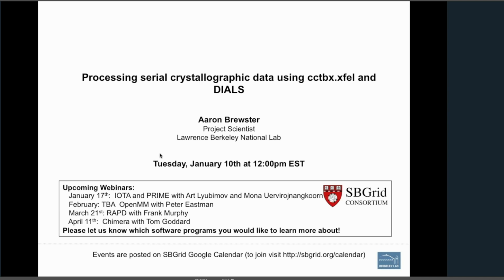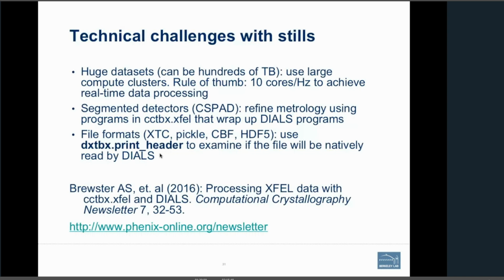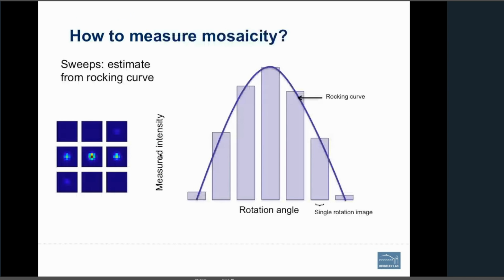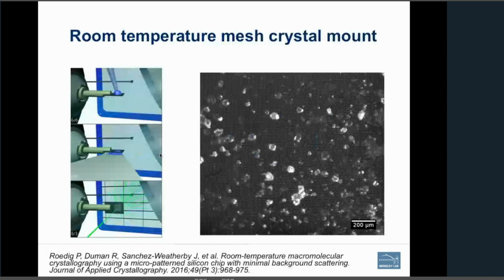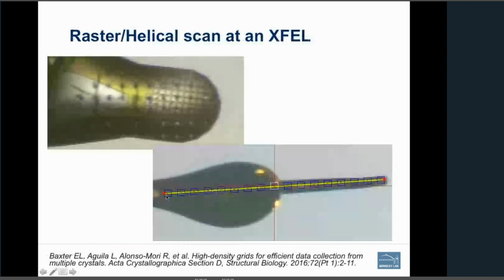So you have, I'm going to give an example of when this was done, very similar to this. Here we go. So something like this. This is a helical scan at an X-ray free electron laser. So each individual shot is a still image because it's a pulsed source. But because we know the rotation between them, then we could couple that information together. The answer is yes.